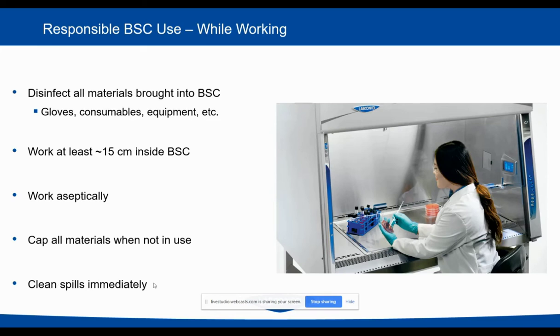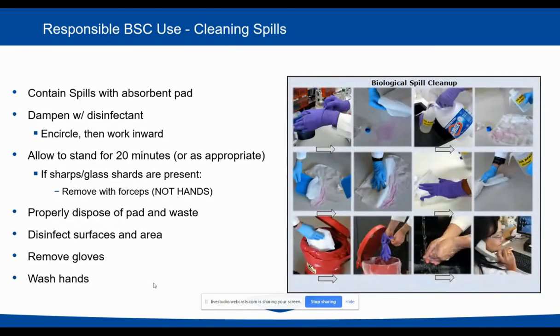Also, if you spill, be a good steward of your biosafety cabinet and your work and clean it up immediately. Don't leave it for the next person who might use the BSC. Don't allow it to impact yourself by getting all into your gloves, and definitely don't allow it to impact your work.